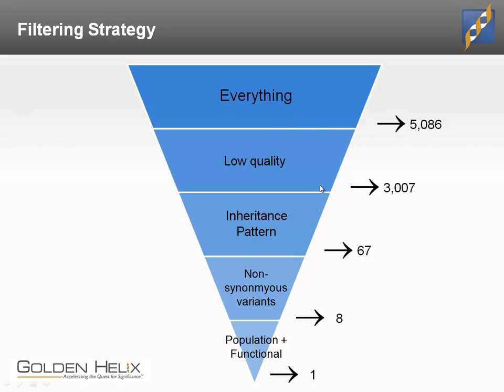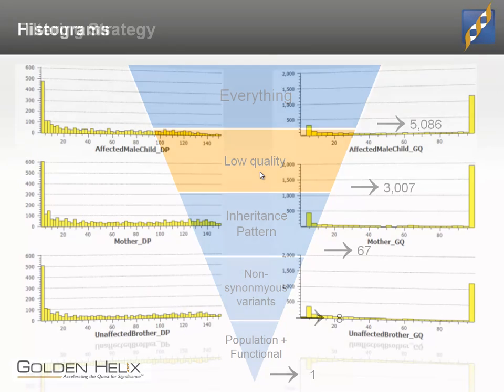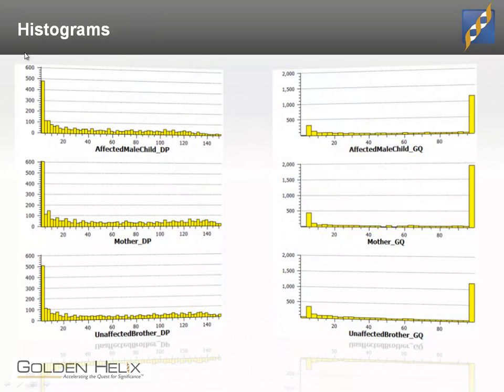And we're going to do, on first pass, an important filter that you should do, or at least investigate, anytime you're looking at variants. Remember, when we call variants, we're not just getting to the point of genotypes. We have supporting information from the actual sequence data itself. That information will include things like the genotype quality and the read depth. And I'm going to show you what that looks like in histogram form.